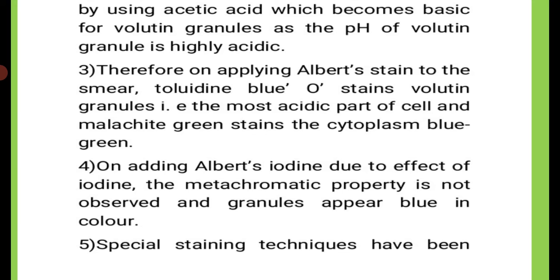On adding Albert's iodine, due to the effect of iodine, the metachromatic property is not observed and granules appear blue in color instead of appearing red.